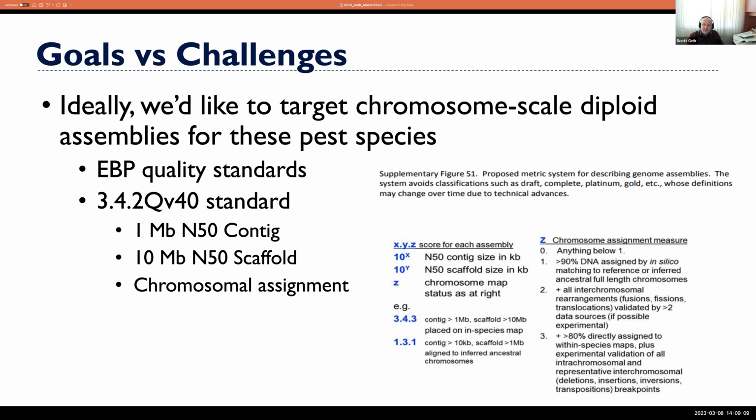within the genome. So, if you're doing a human, a cell culture, whatever, usually these standards are very easy to meet, but sometimes we're doing a mite, a thrips, a tiny little insect, whatever. And so we have to look at how we approach these things and strike out some of these words, like maybe we can't do a diploid assembly. That means separating the two haplotypes of the genome. That has to be done from a single individual. So if you have a very small sample, you might have to pool individuals, or later I'll talk about some other approaches for doing whole genome sequencing from very small samples.